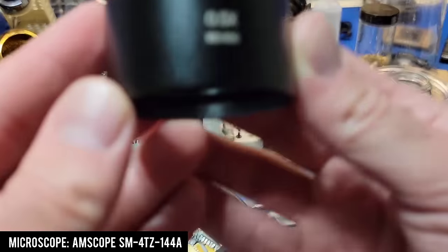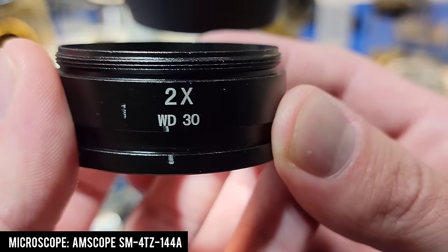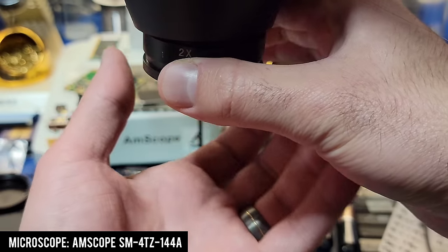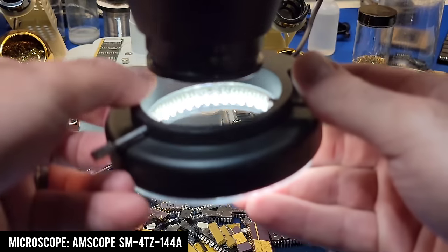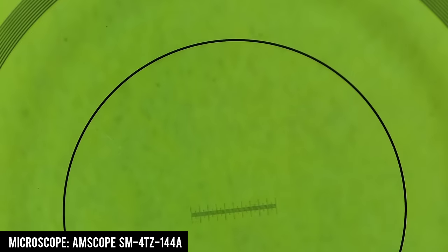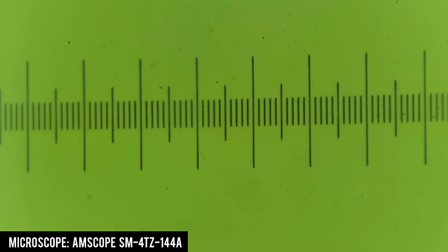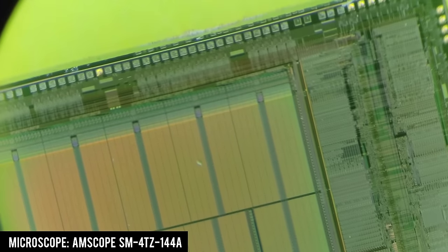After removing the 0.5 Barlow lens I can swap it out for a 2x. The microscope has an internal adjustable magnification of 0.7 to 4.5 times. Using a 10x eyepiece and a 2x Barlow will net us 90 times total magnification. This microscope model comes with an LED ring light fitted with 144 individual LEDs, and attaching the ring light higher helps get closer to the subject. If I swap out the 10x eyepiece for a 25x eyepiece, this microscope is capable of a maximum magnification of 225 times, with about 80 divisions visible across the screen.